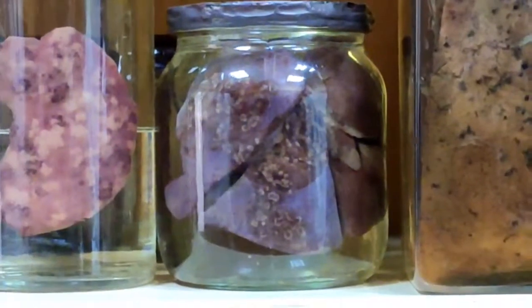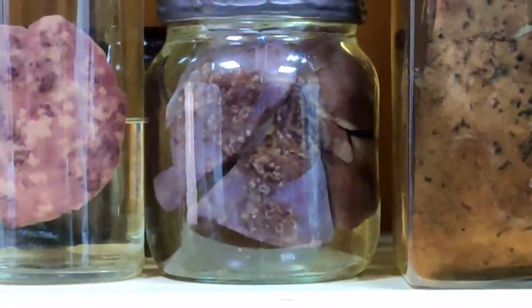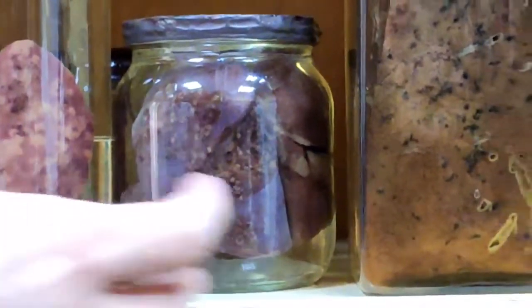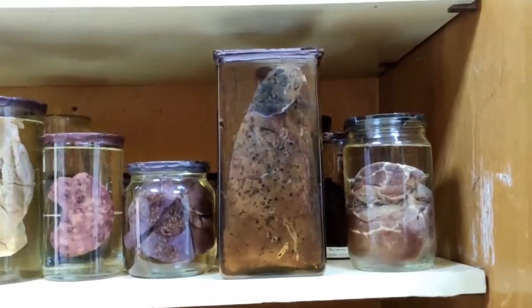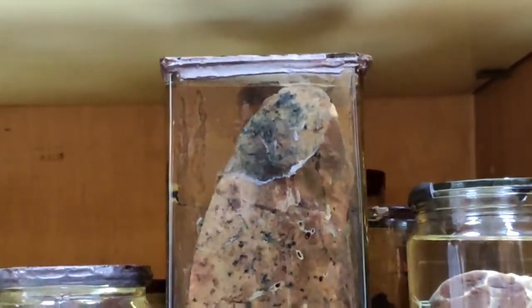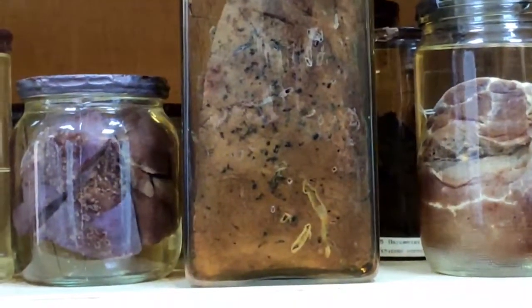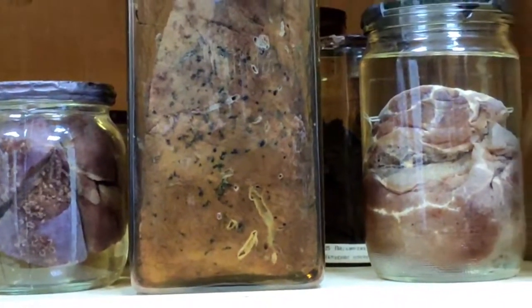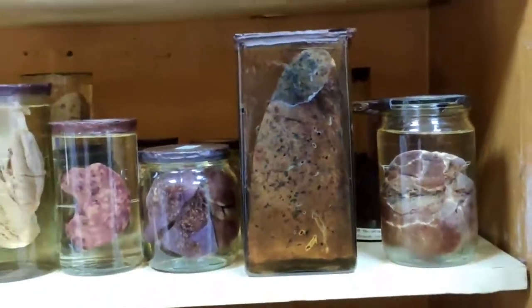You should know the differences of focal pneumonia or bronchopneumonia from lobar pneumonia. And you can see in the next specimen lobar pneumonia, which involves the whole lobe. And we can see very definite steps in development of lobar pneumonia. The first step will be infiltration.